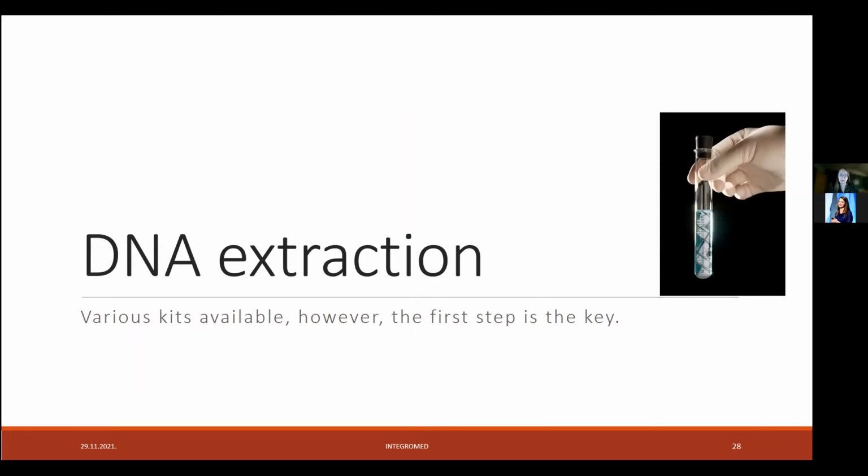Of course, there are various kits for extraction available, and I will not go into detail about these reagent complexes, that everyone can choose freely. It could be a financial aspect, it could depend on where you are located, what kits are available to you and so on.